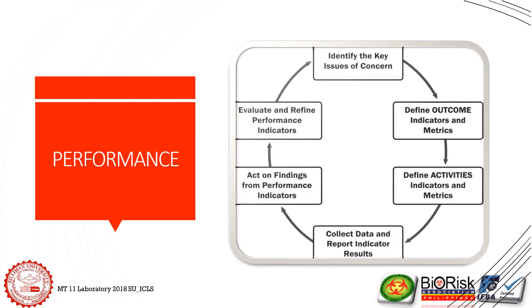The last component of the AMP model is performance. It includes control, assurance, and improvements, and constantly monitors and evaluates mitigation measures to see that they are working as planned. Otherwise, a corrective action will be planned and implemented to protect the entire institution from biological agents and corresponding toxins. The performance component is a constant cycle of identifying issues, defining outcomes and activities, data collection, acting on findings, evaluating, and refining performance indicators.